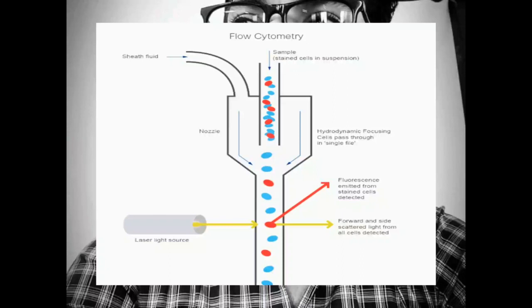So the fluorescence is emitted because, as I said, some antibodies, such as a red fluorescence antibody, are attached. Those are the cell markers or internal cell markers, which are added additionally during the preparation of the cell suspension to attach to the cell.